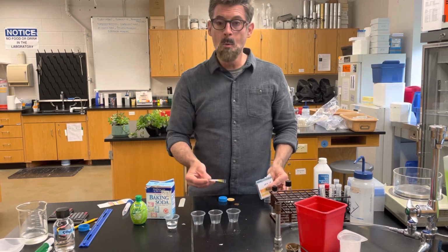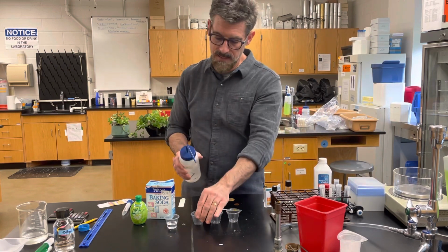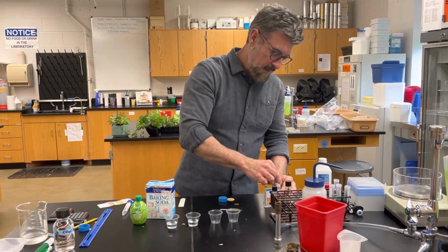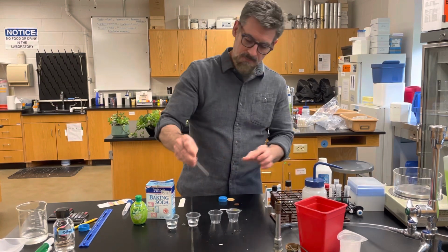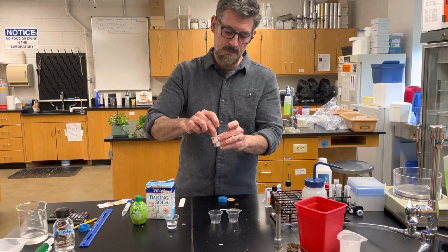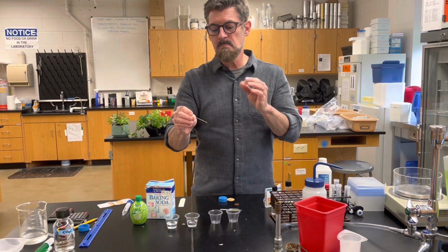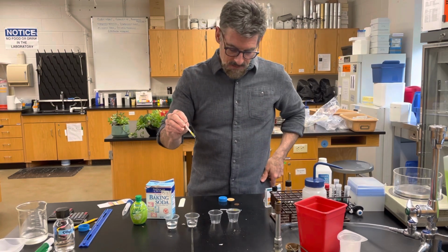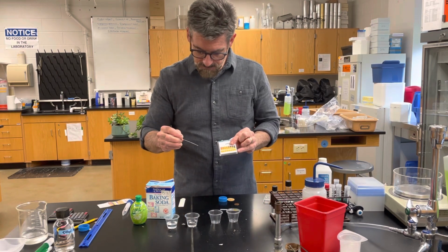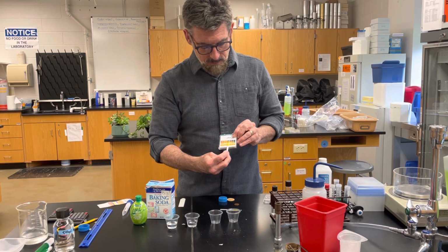So first you're going to measure some water. So that was tap water. I'm going to see if there's any difference here. This is a deionized water from the lab. Sometimes they're fairly different in pH. Now, you only have 6 test strips. You're going to have to be careful and make sure you plan out exactly what you're doing, or you'll run out of strips. Also, it's not going to change immediately. You're going to have to wait 30 seconds to a minute. Much more than a minute isn't really necessary, but you'll probably have to wait a little bit to get an accurate result.